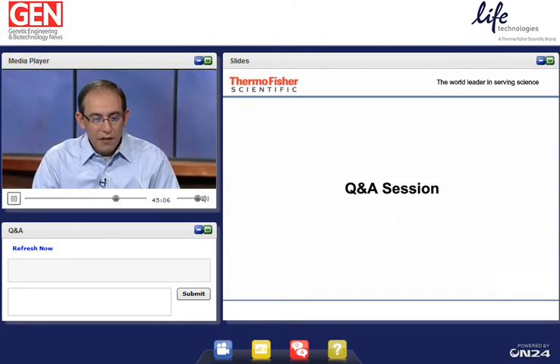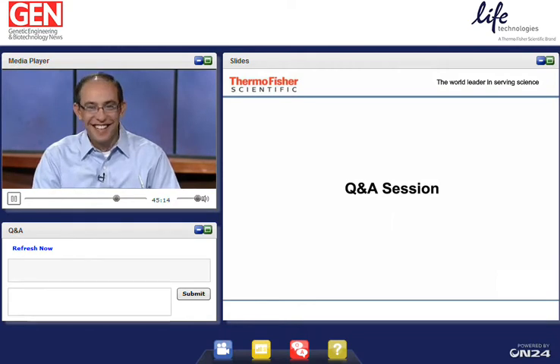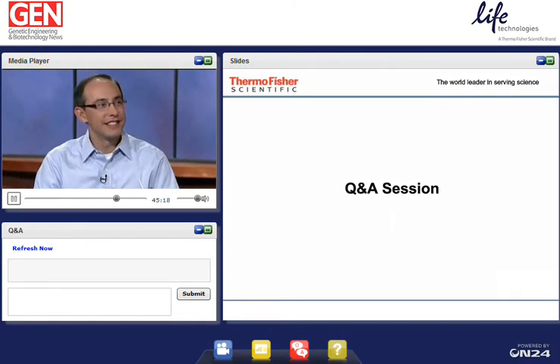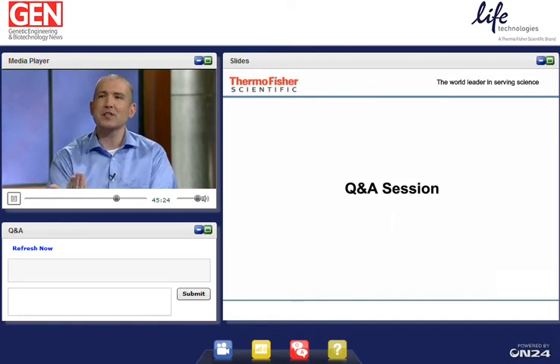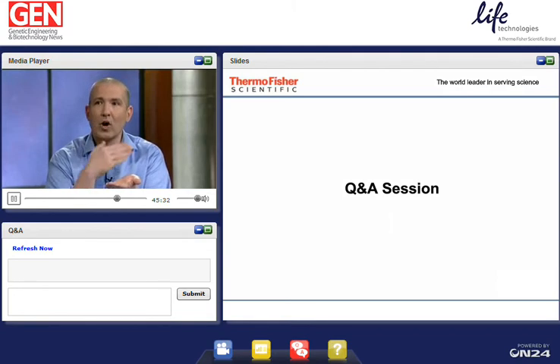Here's another question we have from Gloria at Boston University. How does this work without some type of electrical contribution? I don't know, David. It's simple magic. Physics. It's simple physics. It's capillary action. And I think these slides will be available, or a replay. You can watch that sequential movement again in the animation. It basically just wicks one after the other.